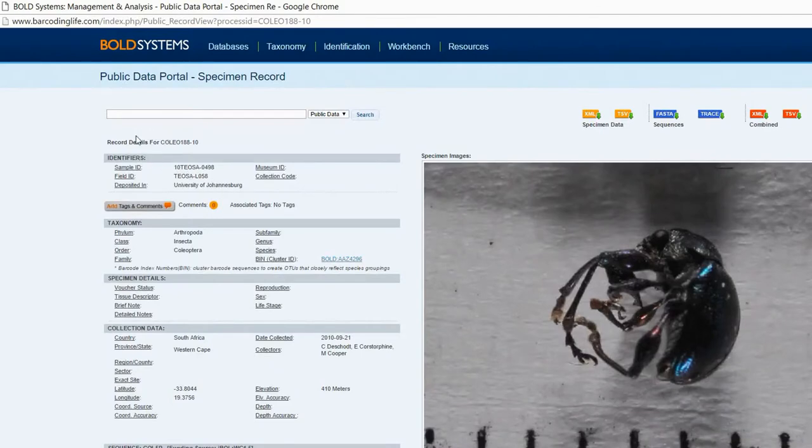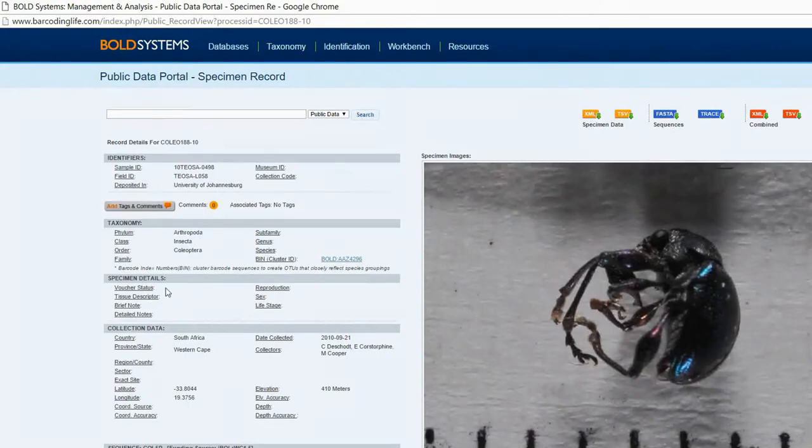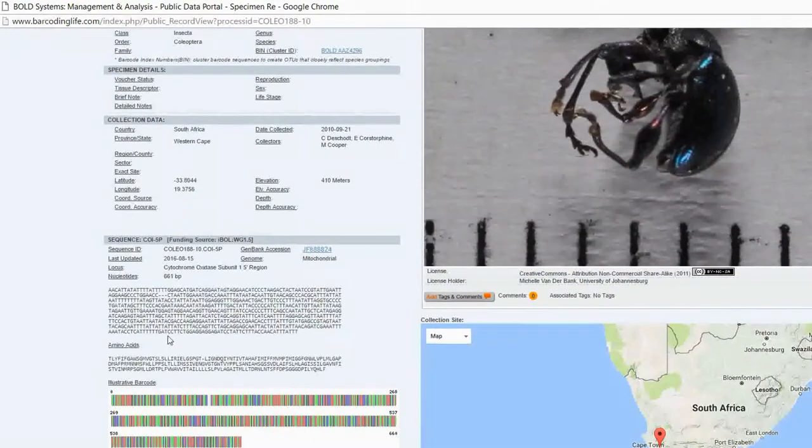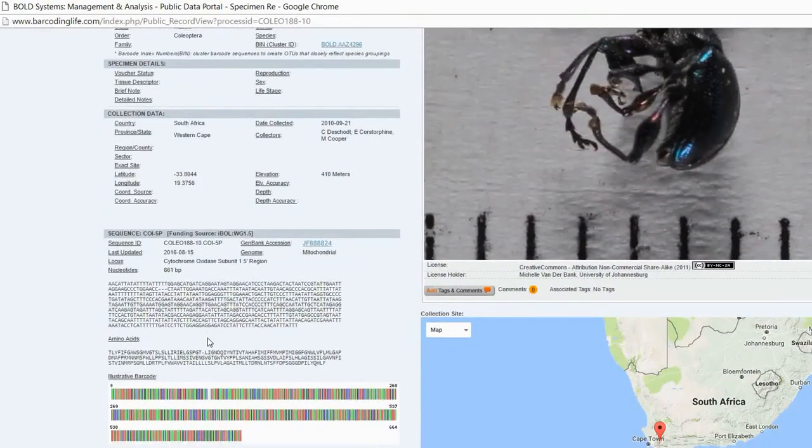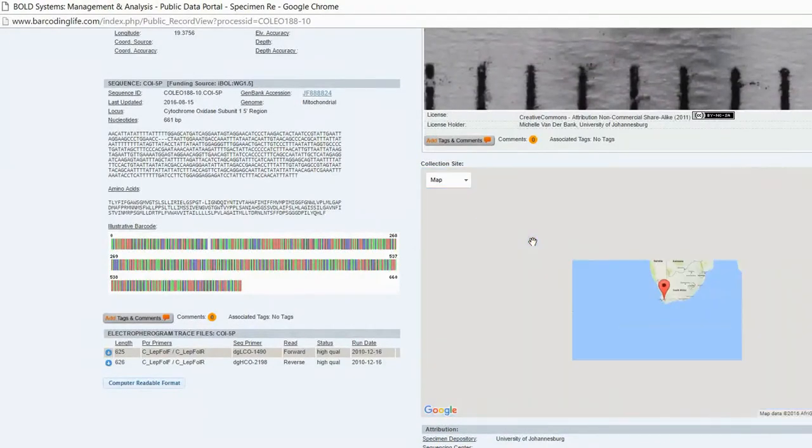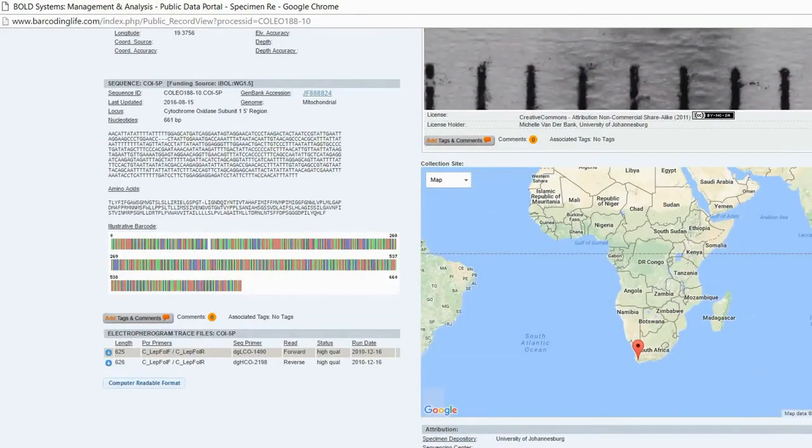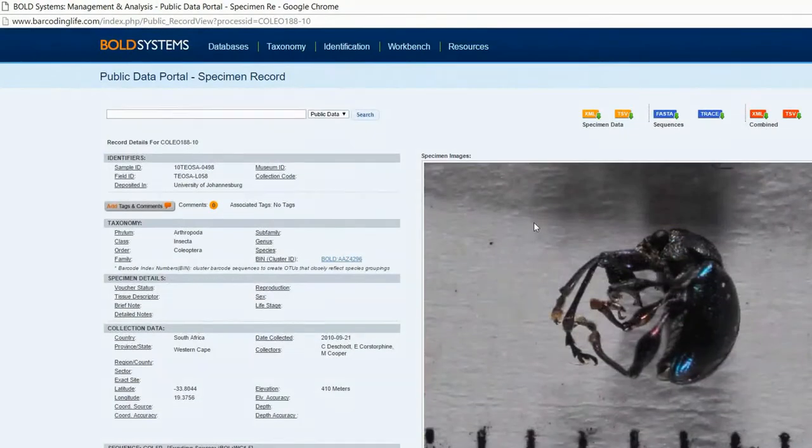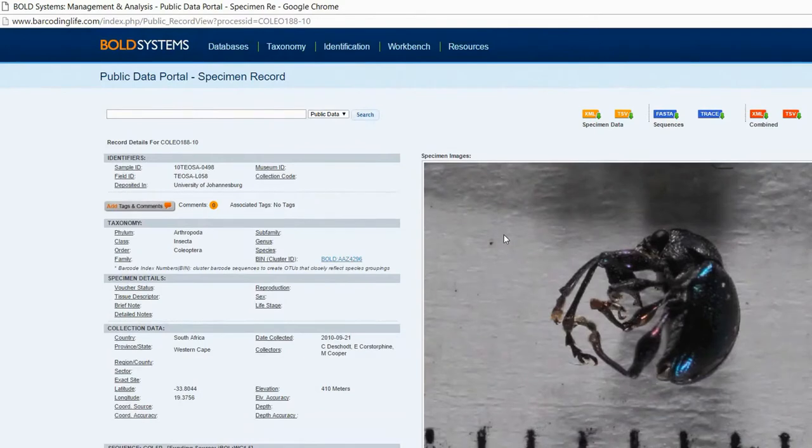You can see they have a sample number, the taxonomy, specimen detail when this was collected, the sequence, the barcode, the data, and also the map. And you have the image also. GenBank only has the sequence information, but they don't have the specimen information.